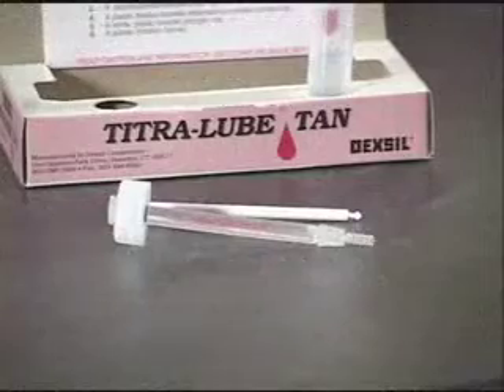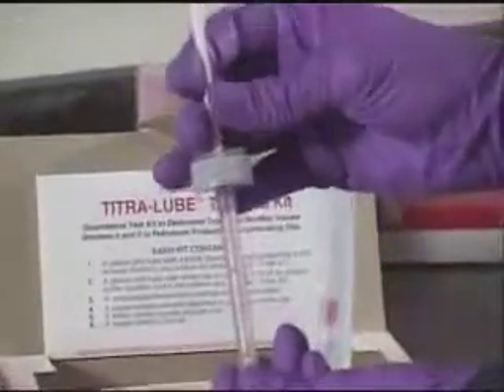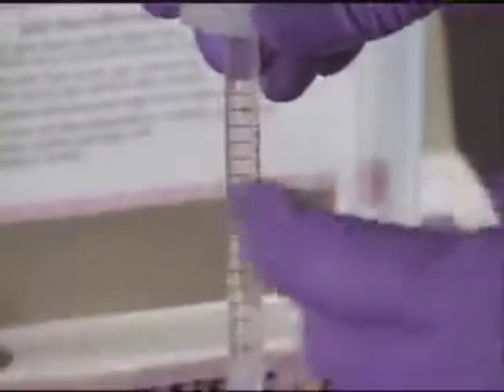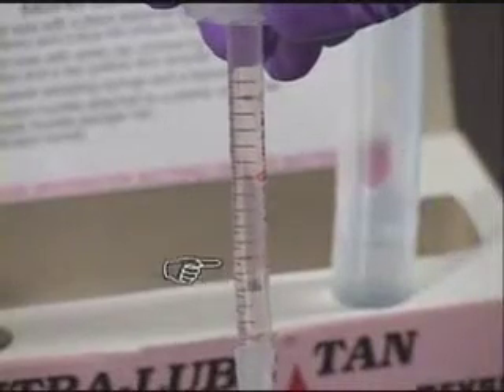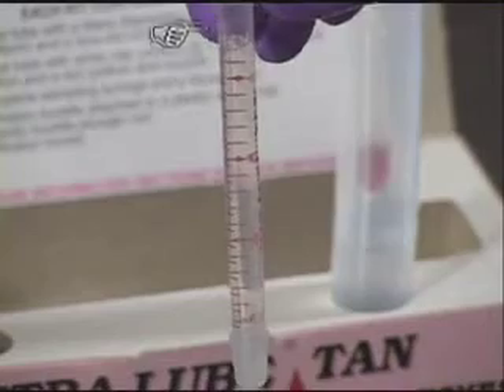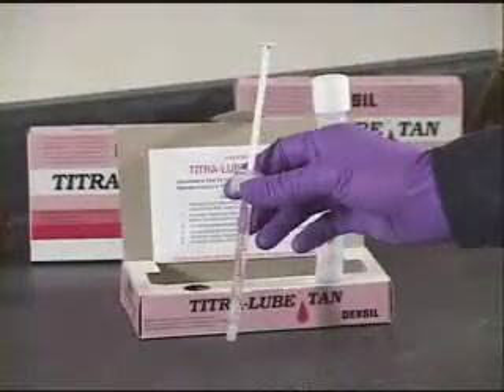At this step, care must be given to the following. After assembly of the titration syringe, there will be a small air bubble inside the tube. Holding the syringe upright, flick the tube gently to raise any air bubble that may be trapped at the bottom of the syringe. This bubble is now calculated into the total volume of the titration syringe.